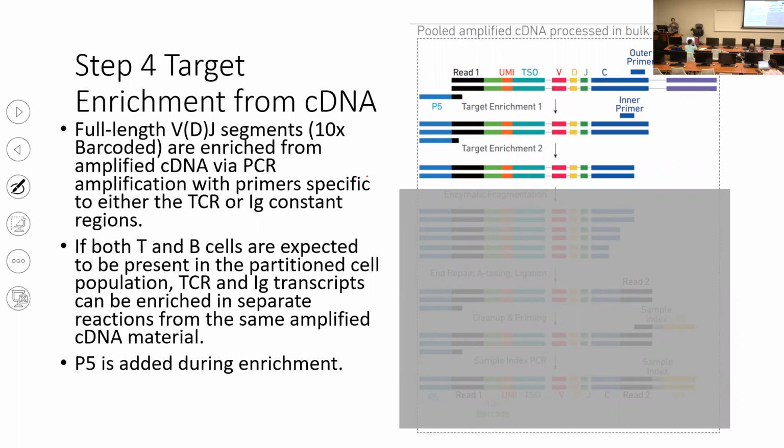On your right side is for the whole transcriptome, but this side only amplifies the T cell receptor or B cell receptor, depending on which type of library you are preparing and want to analyze. So take a look at this and think about it.